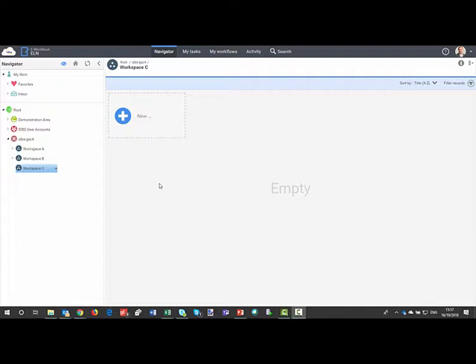Remember, a workspace in Connect is a private area that is invitation only, that allows you to share experimental content with other people who you've invited into that workspace.